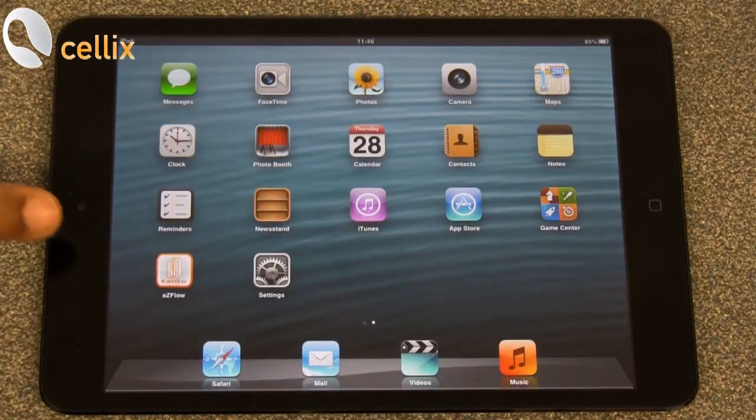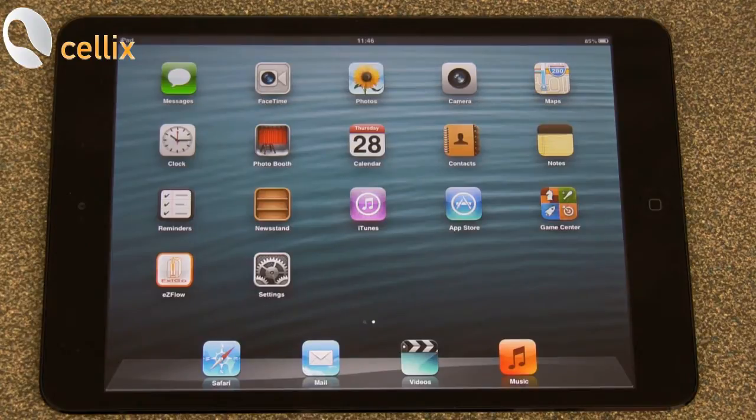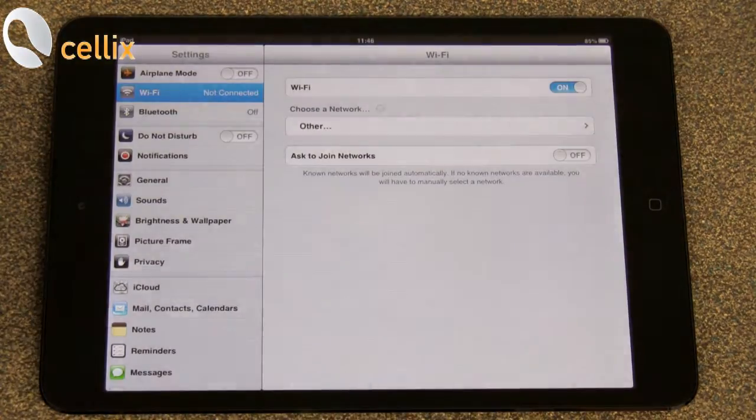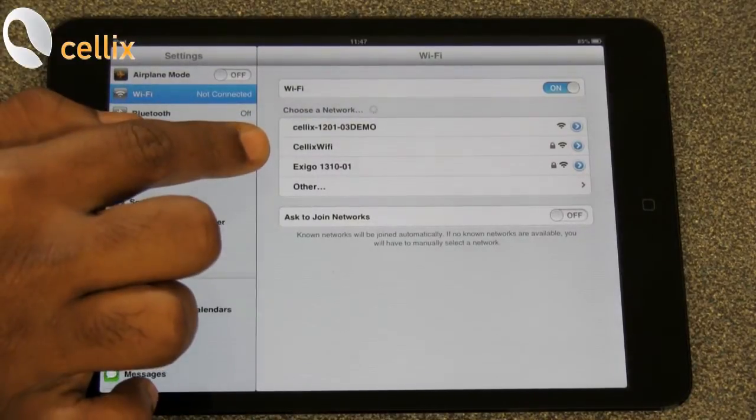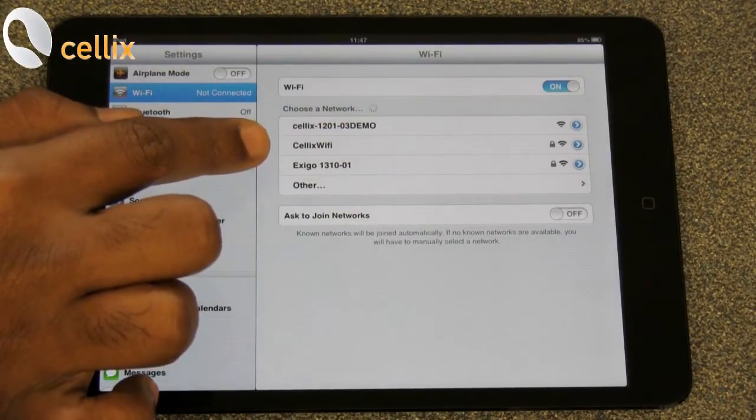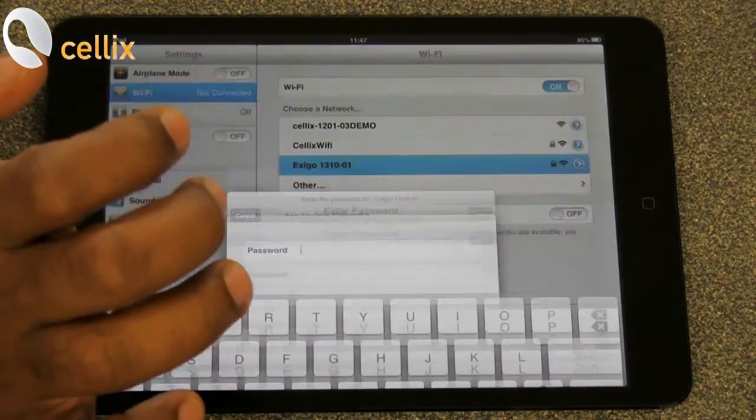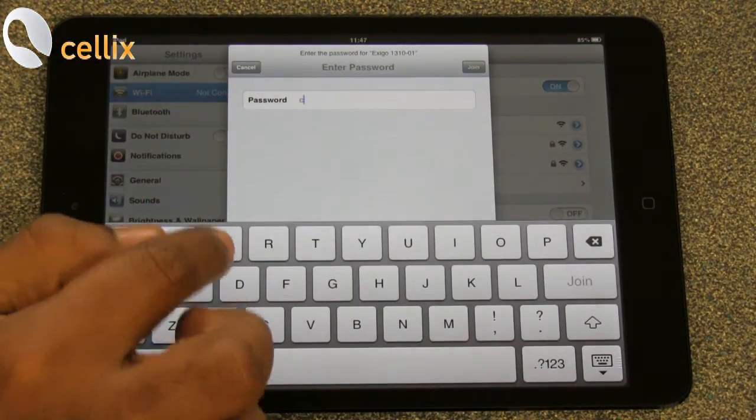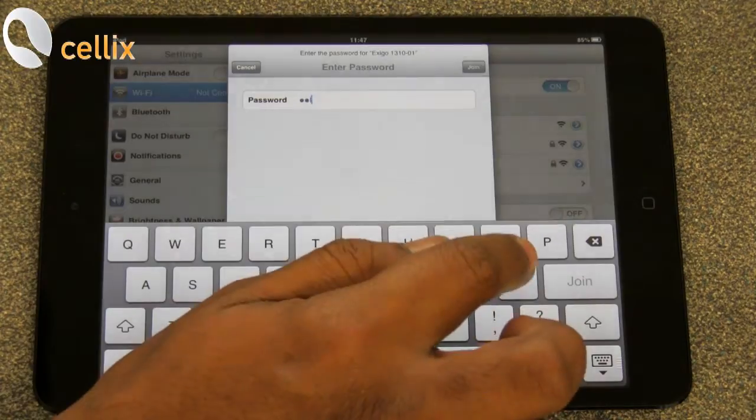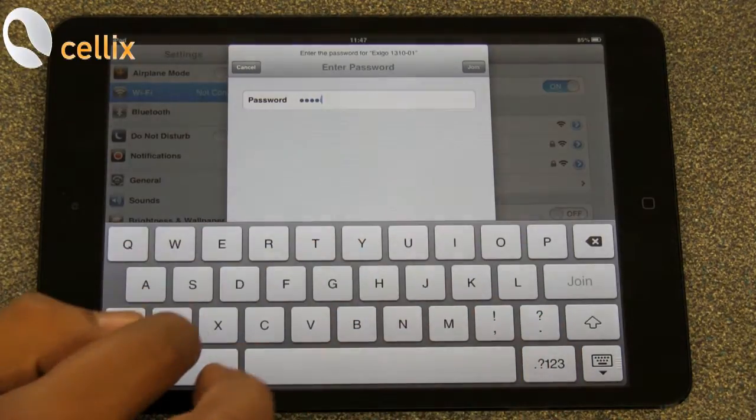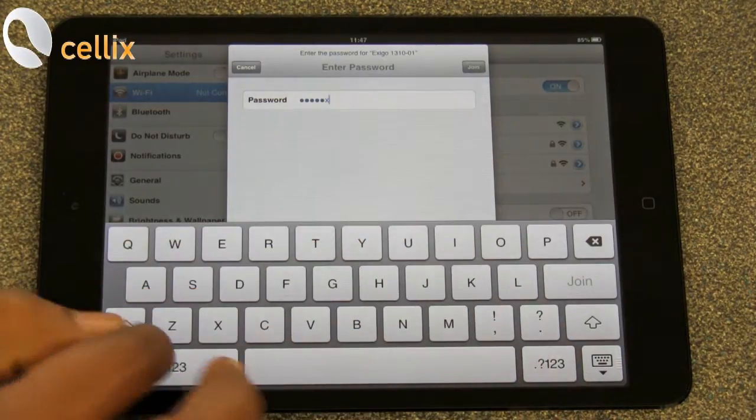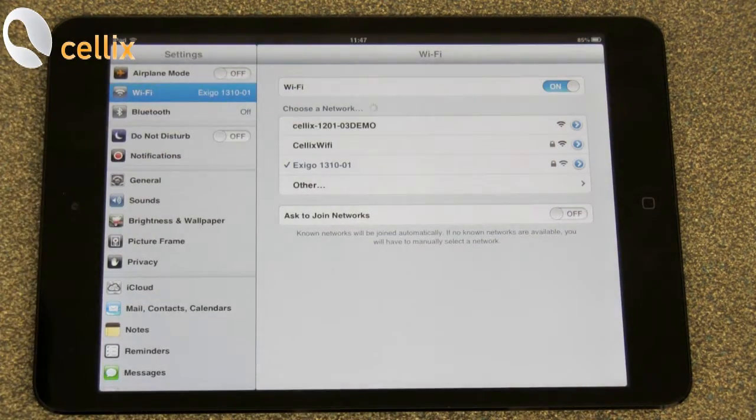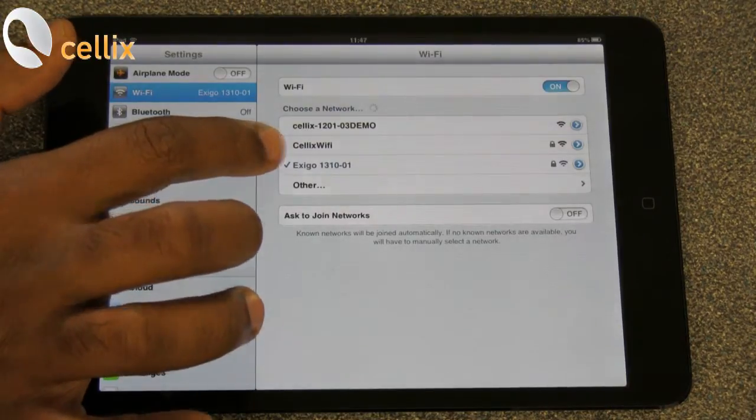Next is to connect the iPad to the pump. For that, you go to settings. You can see the Exigo 1310. You click and you ask for the password that is cellix13, C-E-L-L-I-X-13, and click join. So now it is connected to the pump.